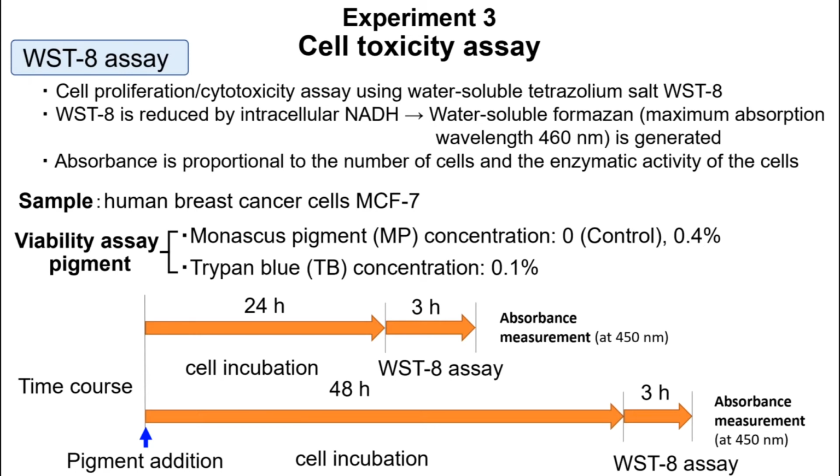WST8 is reduced by NADH produced by dehydrogenase in the cell via 1-methoxy-PMS. Since the absorbance is proportional to the number of cells and the enzymatic activity of the cells, it serves as an indicator of the health of the cells.